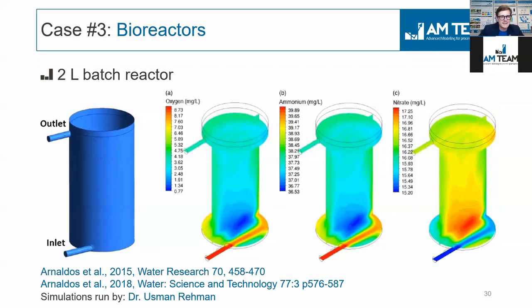Let's continue with a bioreactor example, a case study. Now we go to a longer one. This is a case study of a two-liter batch reactor in the lab.